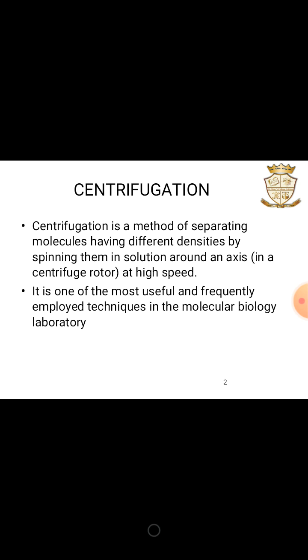Centrifugation is a method of separating molecules having different densities by spinning them in a solution around an axis at a high speed. It is one of the most useful and frequently employed techniques in the molecular biology laboratory.